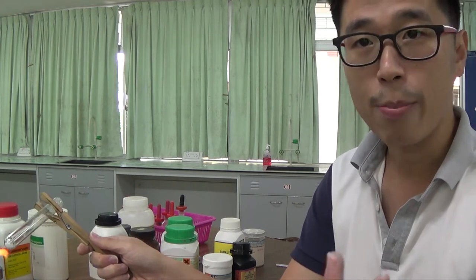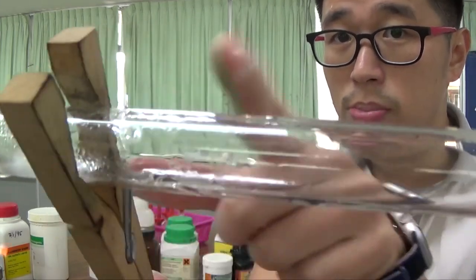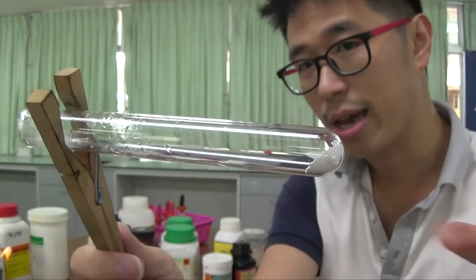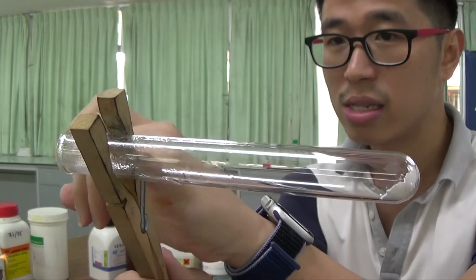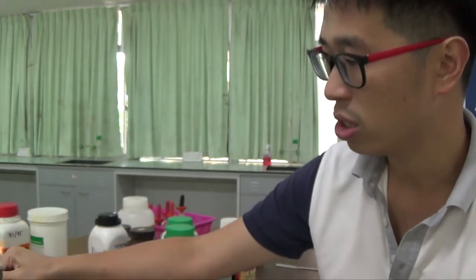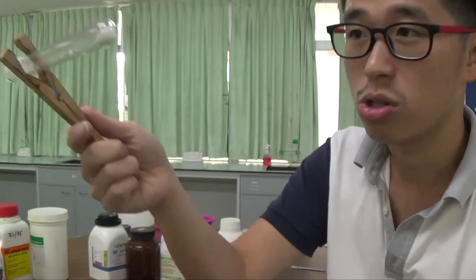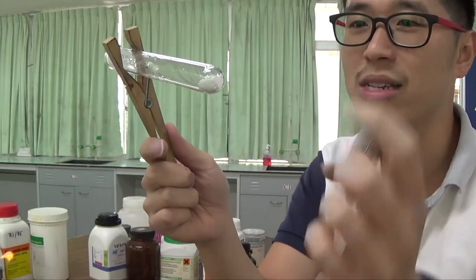But here, my point is, you get a colorless liquid formed on the upper part of the tube because the steam that escaped from the water of crystallization escaped as H2O gas, from the hot end to the cold end, and that condenses, so you get colorless liquid on the upper part of the tube. That is one observation, all right? And of course, what happened to the solid? The white solid remains there, okay? Usually, it becomes very hard to remove because it dries out on the end of the test tube.